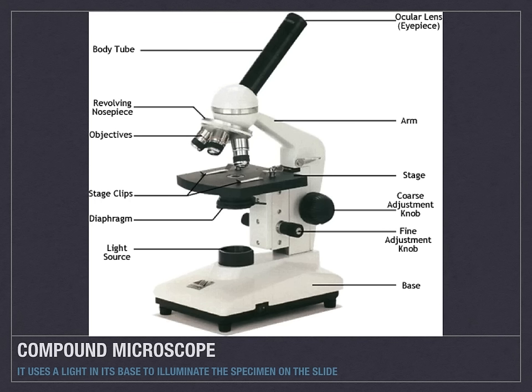As you can see, the compound microscope does use a light source located down at the bottom center.